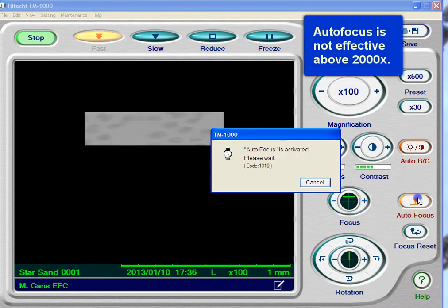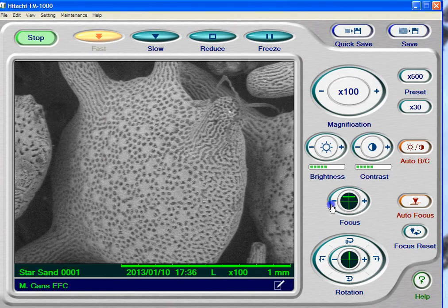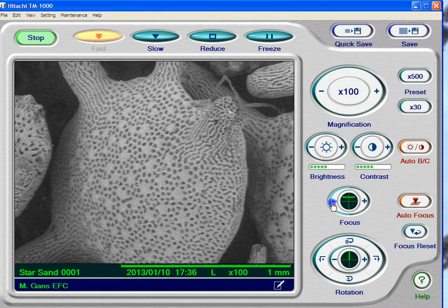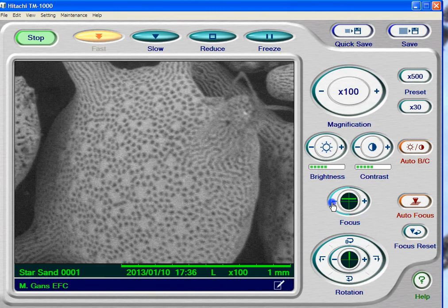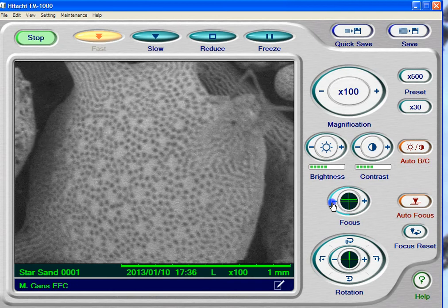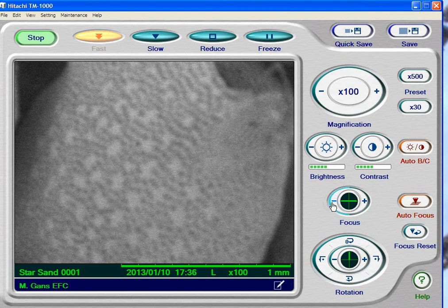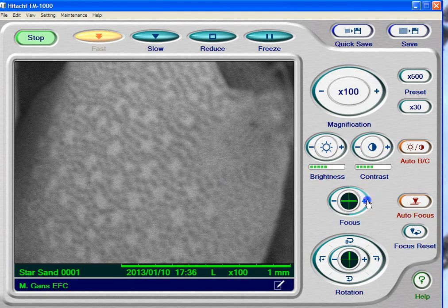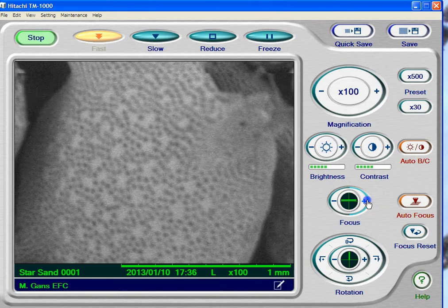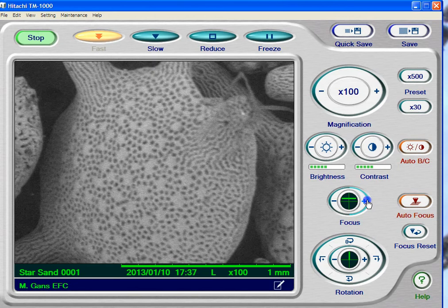For focus, you can autofocus, which works really well as long as you're under about 1,000x magnification — past that it's not really going to work very well. You can also hold down the plus and minus buttons to change the focus. I'm going to get this way out of focus by holding the minus down. You'll notice that green line in the middle — that is marking the focal point, and you can see the focal point is dropping down, showing this thing has dimension to it. I'm going to hold the plus down and go back up and get it in as good a focus as we can. You're just trying to get the prettiest picture that you possibly can.